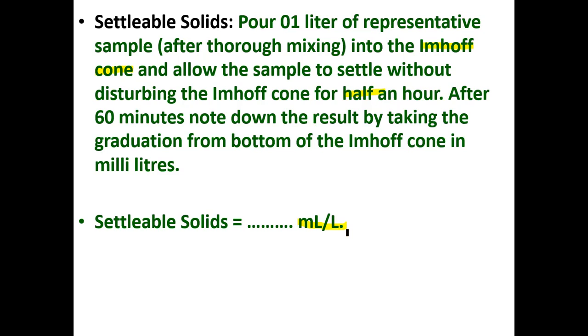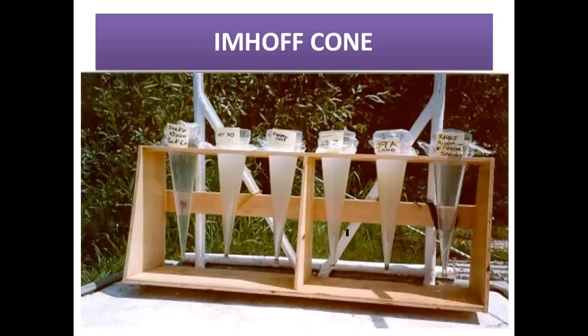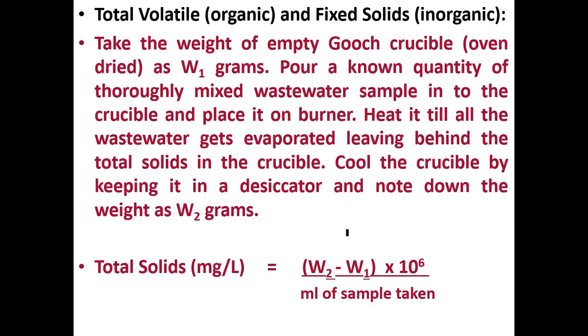Per liter of the sample. Those are called settleable solids. Basically, these settleable solids help us in designing some of the water treatment and wastewater treatment units. This is how the Imhoff cone looks. It will be made of glass or transparent material. This will be given in a demo in lab.